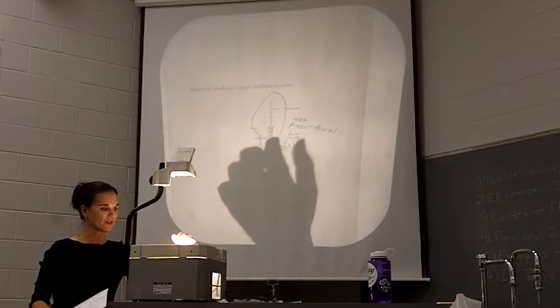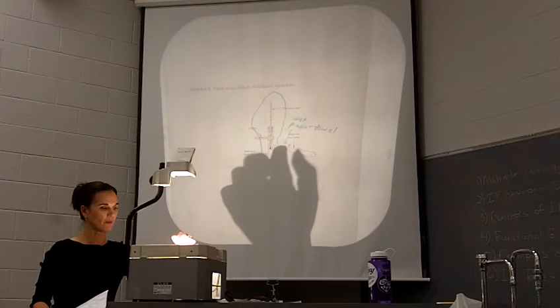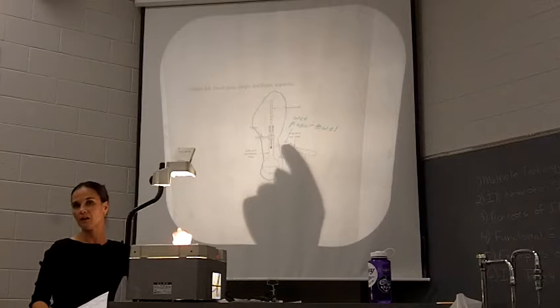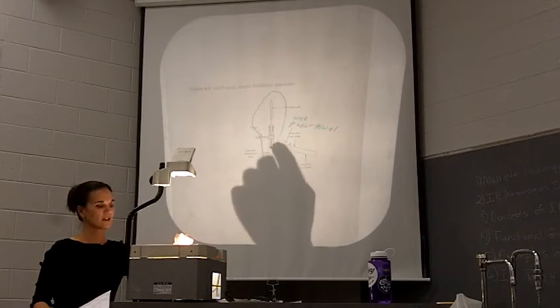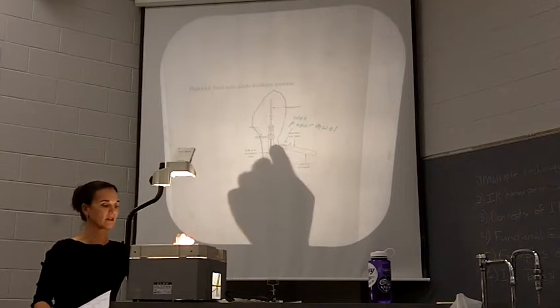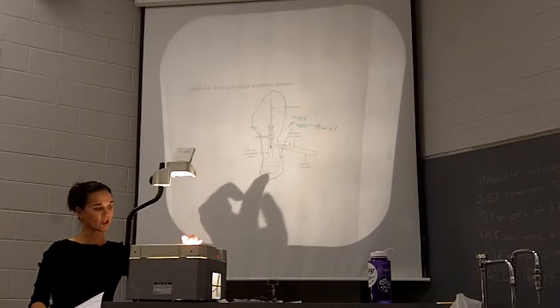So your condenser for this is this arm here. What you can do is put a little bit of a wet paper towel on this arm before it goes into the sidearm test tube, and that can help condense it. The pipe cleaner that you have in your drawer, you can use that to tie the paper towel on that arm so it stays on there. And then when you're doing this distillation, you want to be careful.